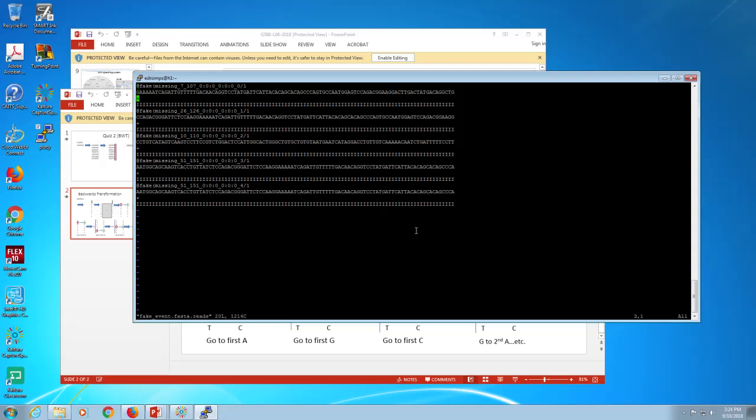So here we have some example reads from a FASTQ file, right? And if I'm going to process these programmatically, what I need to know is which characters are there, which characters aren't there. A lot of times, these files have different ways of encoding something like a space or a tab or a dash or a backslash or things like that. If I need to know what the hidden characters are, I can do set list in Vi, and it will show me the end line characters. If there were tabs, it would show me symbols for those as well.